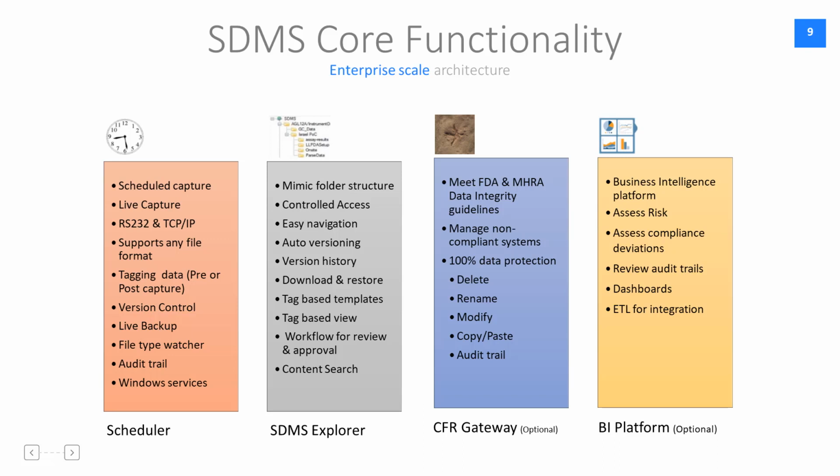Users will be able to download the files provided they have the rights to download files. Users will also be able to restore the data. There is a difference between download and restore. Download will simply download the data at any location that the user points, and it will download only a specific file.